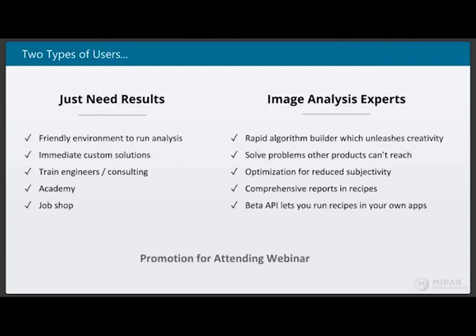The approach that I would take is a color deconvolution approach, where basically what you do is have the software break up the image into its individual colors, not just red, blue, and green, but the colors of the minerals, and then do the segmentation from that instead of maybe the original color image.